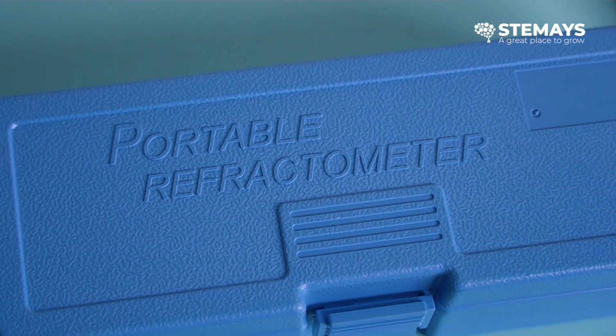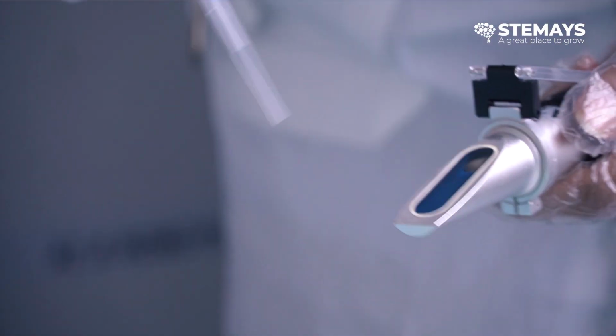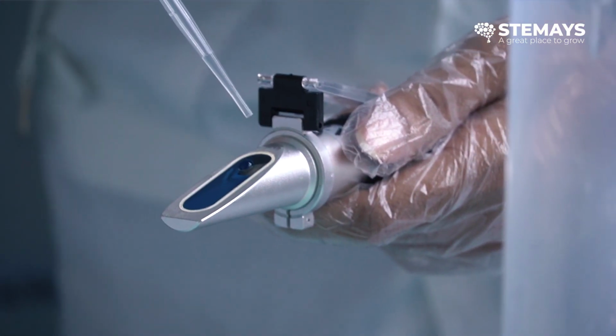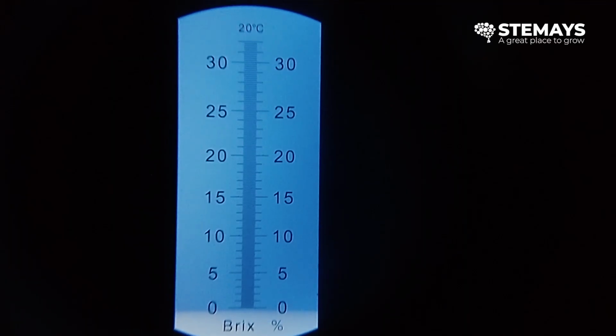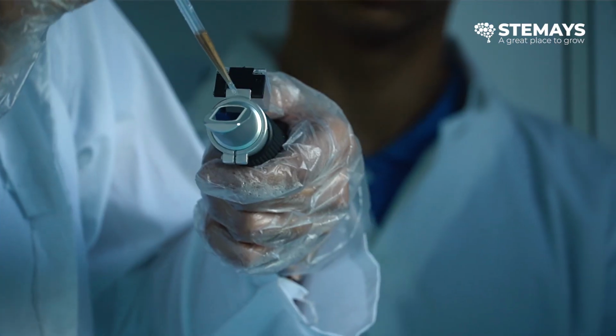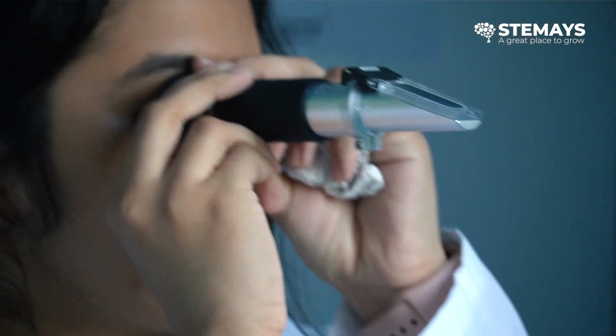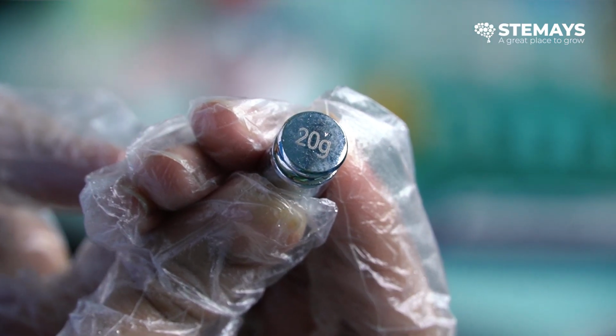After this experiment, we did another experiment with a refractometer, which was very cool. We tested how much sugar there is in a cold drinks bottle. We first neutralized the refractometer by putting water into it, and we set the scale to 0. After that, we took some drops of the cold drink and placed them on the refractometer. We found out that there are 10 grams of sugar in 100 grams of the cold drink. So in total there's 20 grams of sugar in the whole bottle of cold drink.